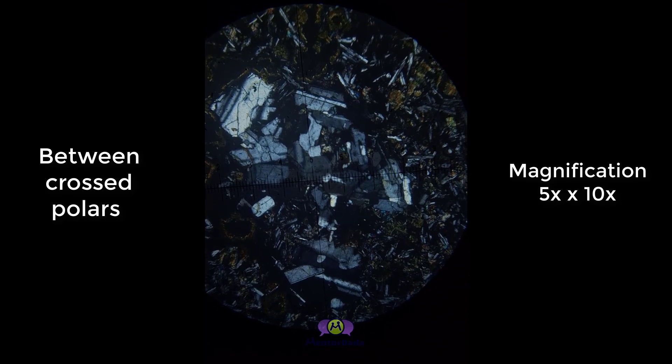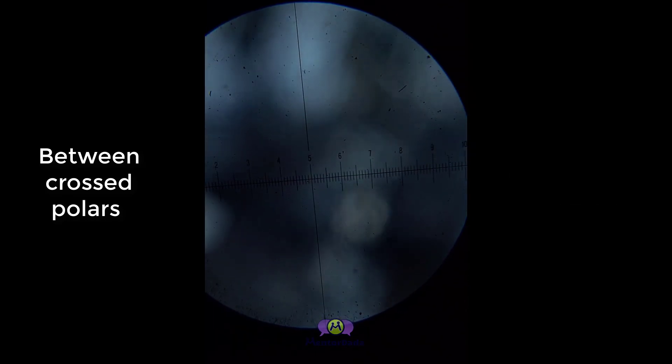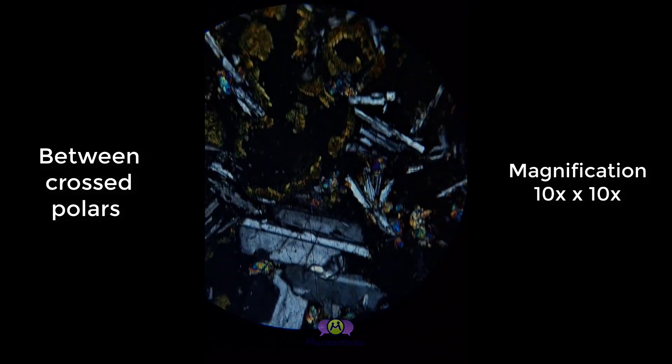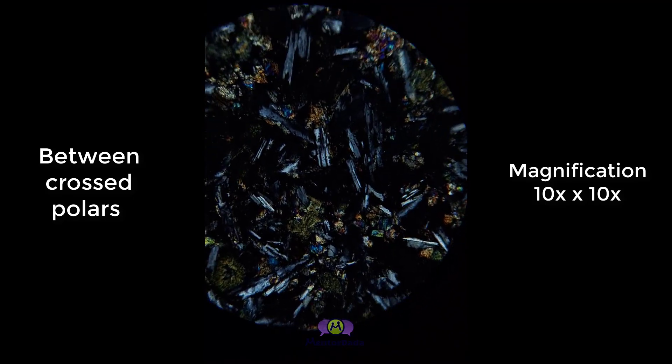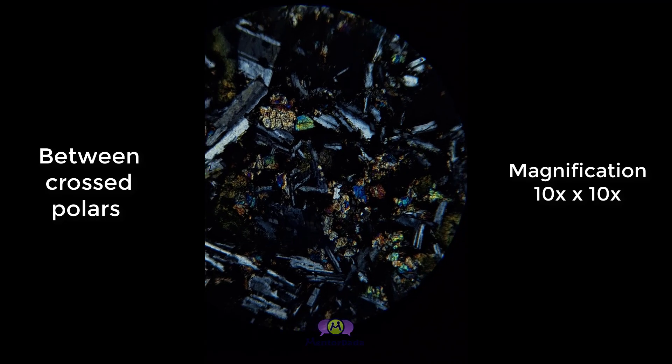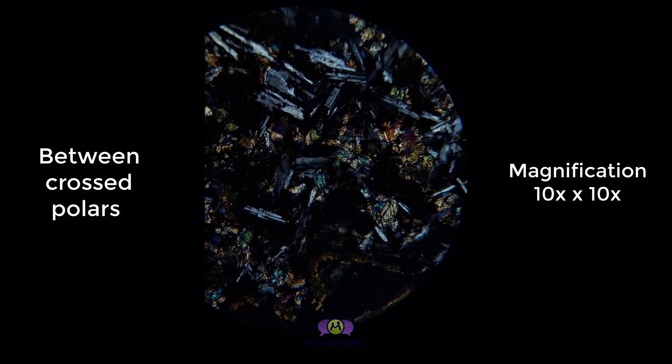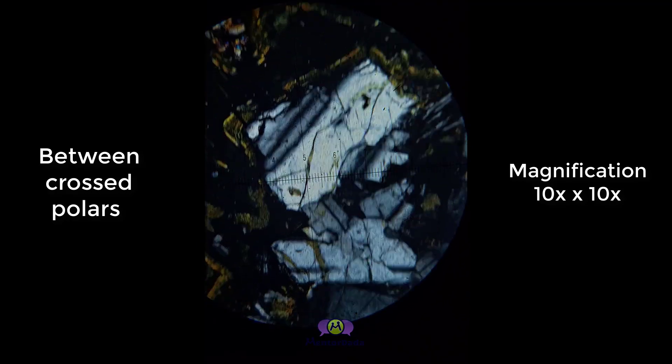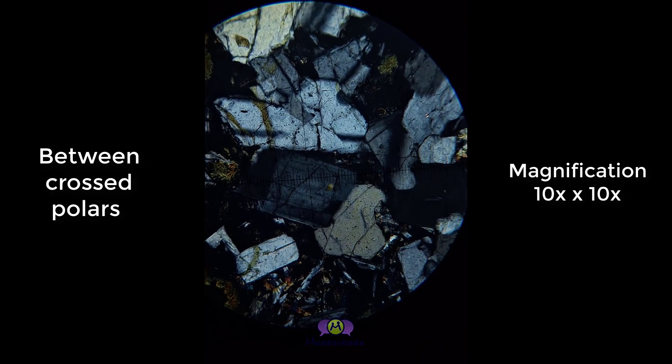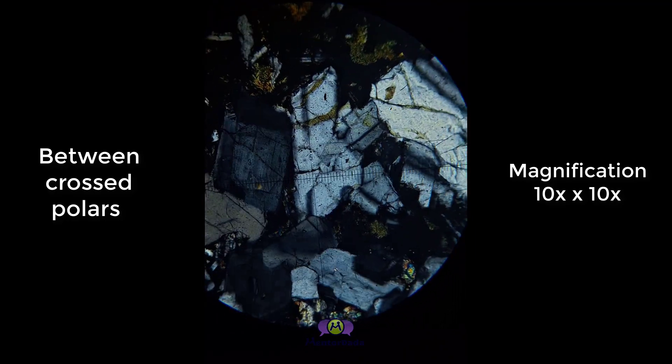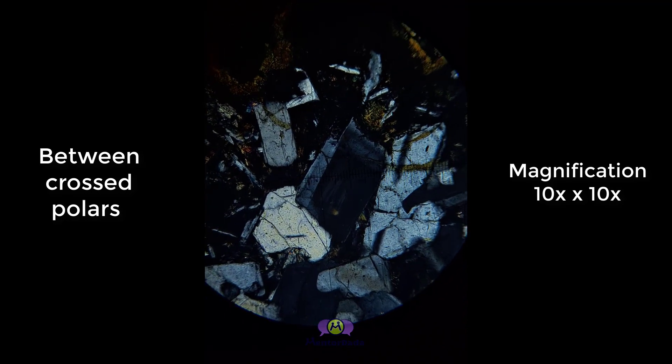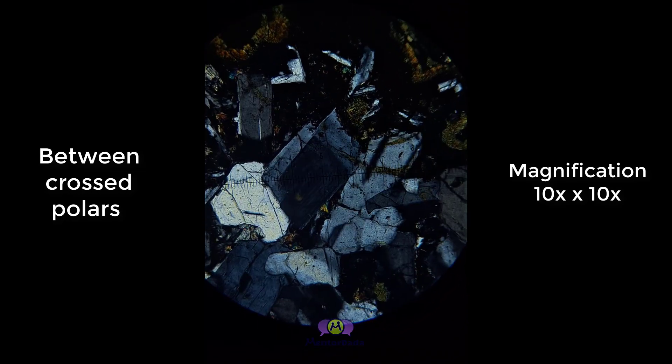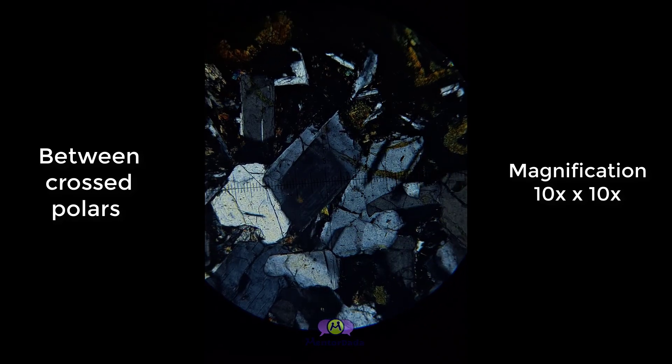Now 10x magnification has been chosen. You are observing the plagioclase feldspar with the yellow portions which are mainly pyroxenes. At the central part, you are observing a grain of plagioclase showing a zoning effect.